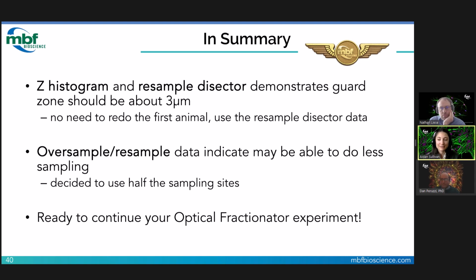Yeah. I am feeling so much more confident now, Dan. Thanks so much for going through my data with me. I am going to keep counting the rest of my animals. I'm ready to finish my optical fractionator experiment.